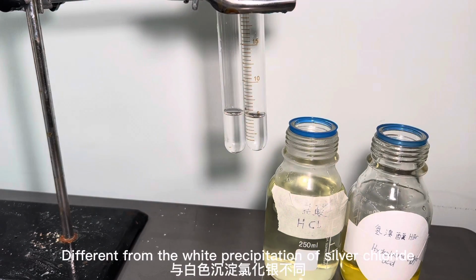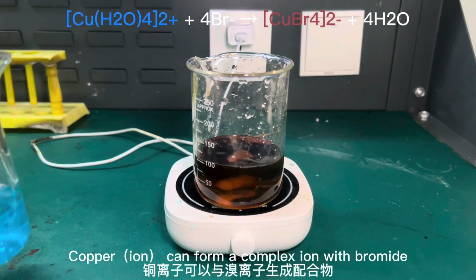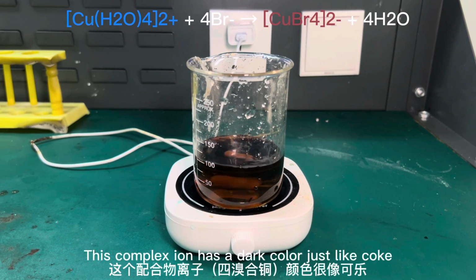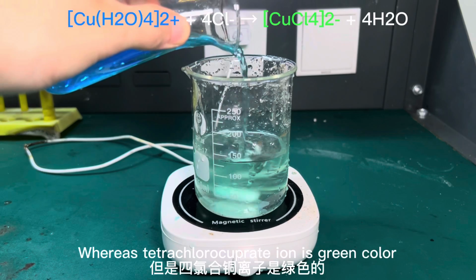Next, I use silver nitrate solution to test for silver bromide precipitation. Different from the white precipitate of silver chloride, silver bromide is a yellow precipitate. Copper can form a complex ion with bromide. This complex ion has a dark color just like Coke, whereas the tetrachlorocuprate ion is green.